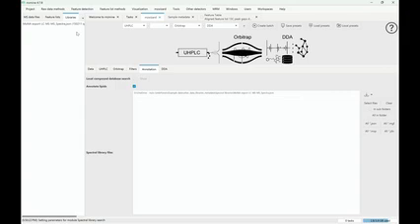But what we also do is we export for other tools, and then you can basically just also run other annotation tools and get the results in mzmine or in your Python or whatever scripts. So particularly I'm using your tool for the GCMS, and I find some issue with the library matching when we are comparing with the NIST one.